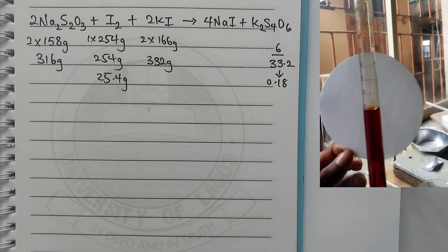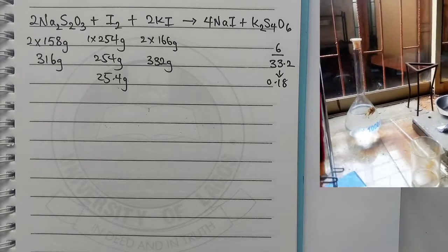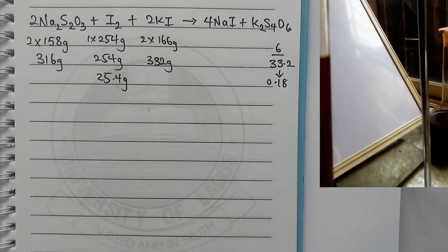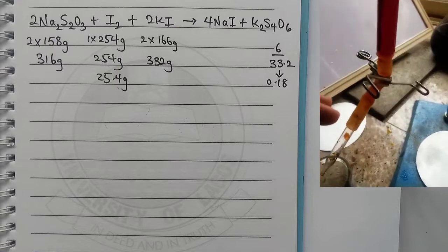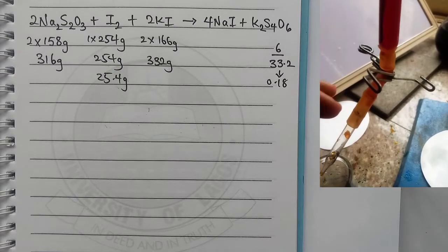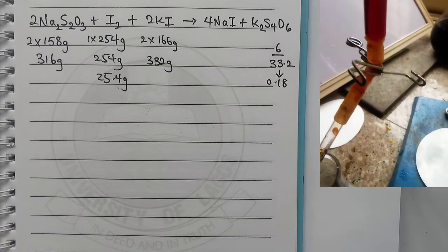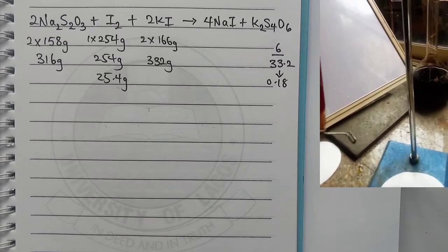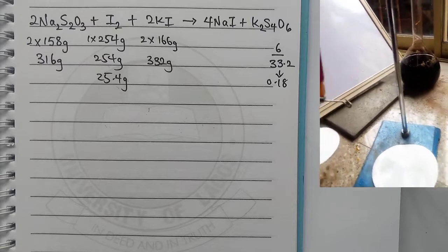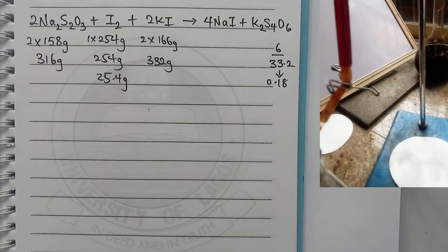Then you see what I did in the video. With God's grace, I was able to get 43. That means that if I have 150 centimeter cube given to my students, they can actually make 3 titers. But if you're having 100 and something, you might not be able to have more than 1 titer value, with the 150 centimeter cube they asked us to give the student.